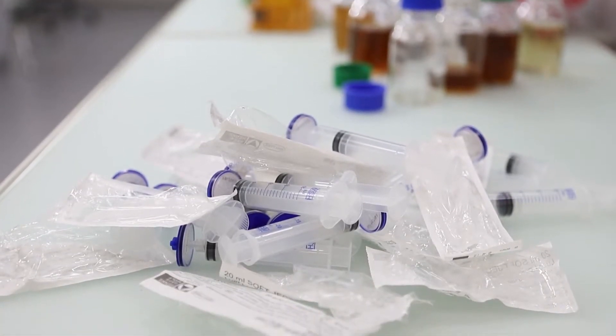With Metrom IC, there's an alternative that saves time and costs and also reduces the burden on the environment: inline ultrafiltration.